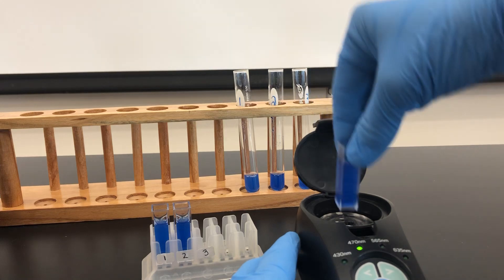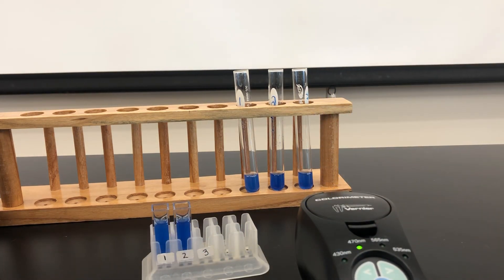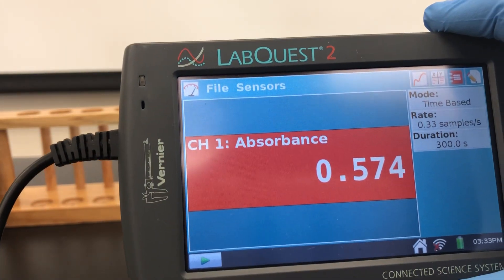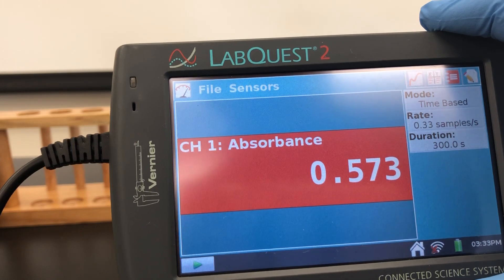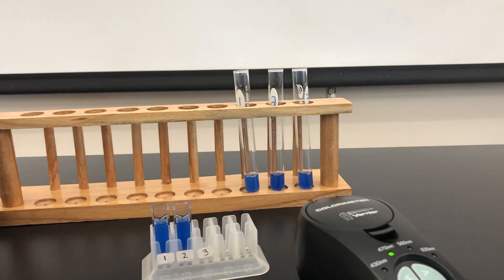And for tube three, our absorbance is 0.573. All right, we'll wait for another five minutes.